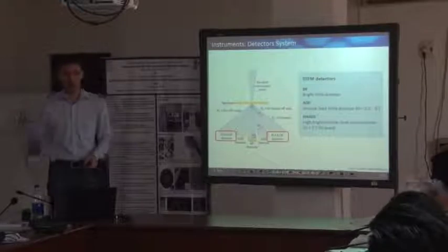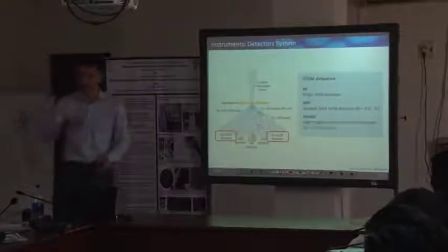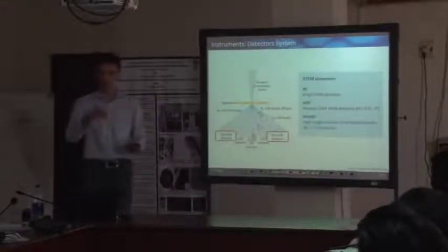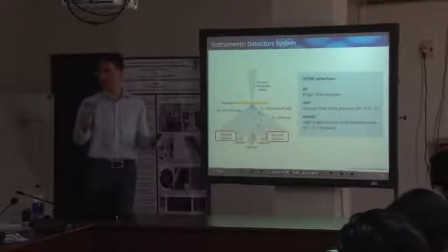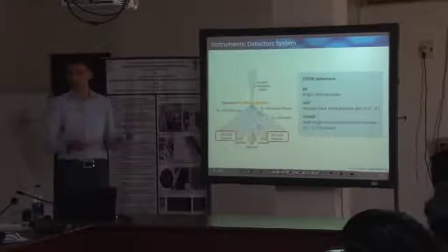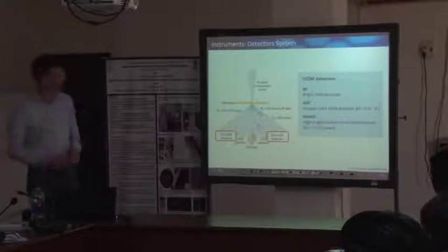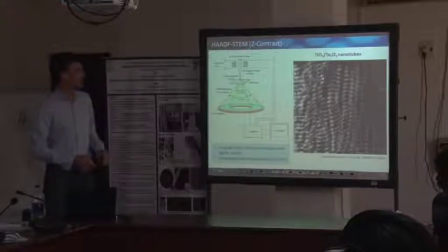For data acquisition, you might use a prolonged dwell time in each measurement. There are different ways. For instance, if the sample drifts, you might just record your frame with a very short dwell time, do some drift correction, and then record and integrate those. All the scan modes that you have available in the scanning electron microscope are available in the transmission electron microscope. Let's have a look at how those images look.